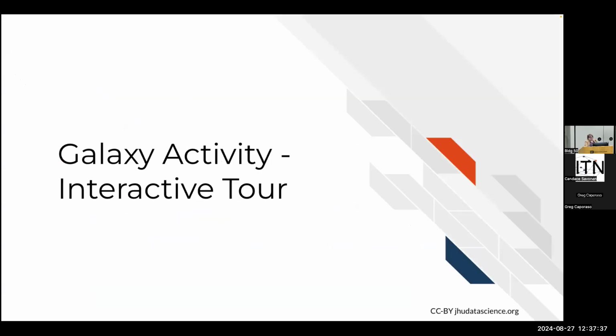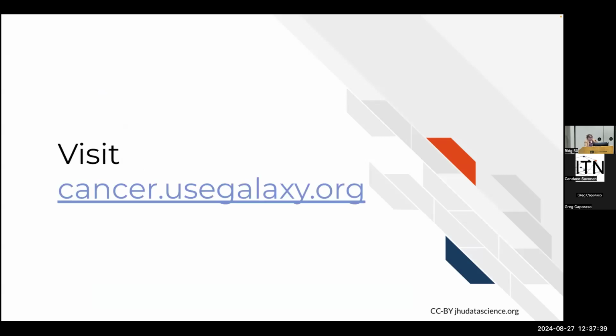So let's actually look at Galaxy. Please visit cancer.usegalaxy.org.